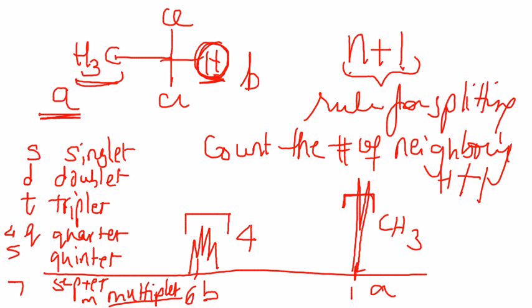The splitting occurs with only close vicinity hydrogens. That means usually neighboring hydrogen atoms. So you're not going to see something that's 5 carbons away. You're not going to see splitting in that case. And in terms of splitting, if you have to predict whether it's a doublet or a triplet or what, then you just follow the N+1 rule.